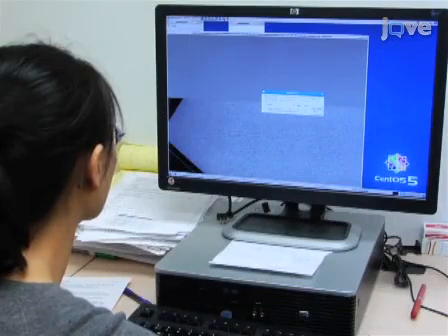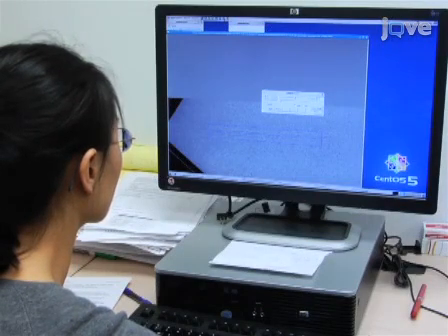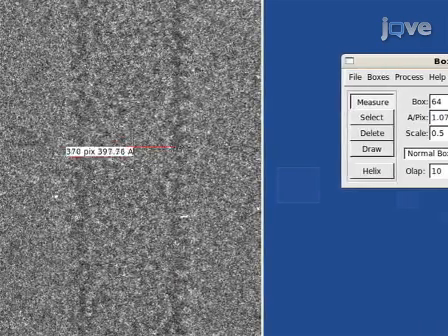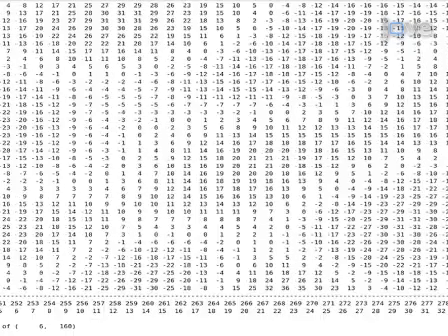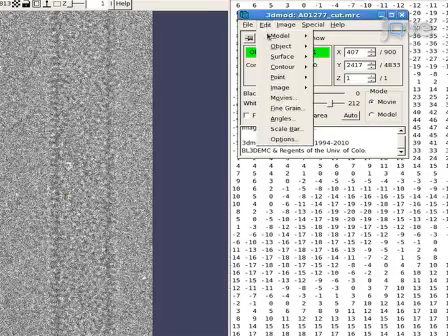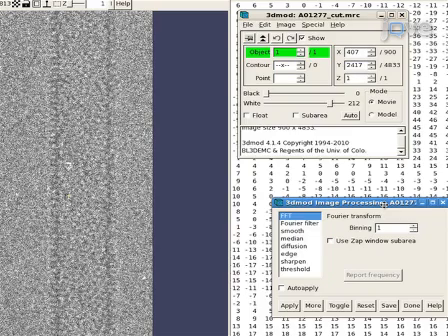To begin helical indexing, use EMAN's program Helixboxer to box out a relatively long and straight tube with uniform diameter and save the image in MRC format. Then measure the radius of the tube using EMAN's program Boxer. Determine the helical repeat distance using a cross-correlation-based program, such as IMG-CCF in the MRC package. Then calculate the Fourier transform with a new box length that is an integral multiple of the repeat distance.